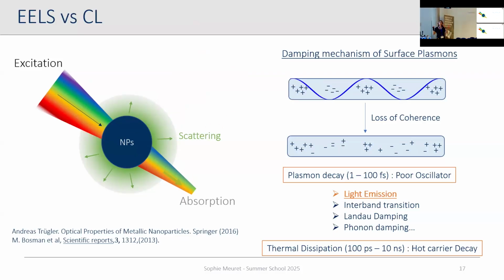The way I'm doing the difference between scattering and emission, of course, that can be debatable, is that in a way, the scattering is just the same photon going in and out, so same property. And the other one is when you have a change and you're basically inside your nanoparticle, you're creating a photon. So basically, it means that the light going out actually is the same kind of property as the light coming in.